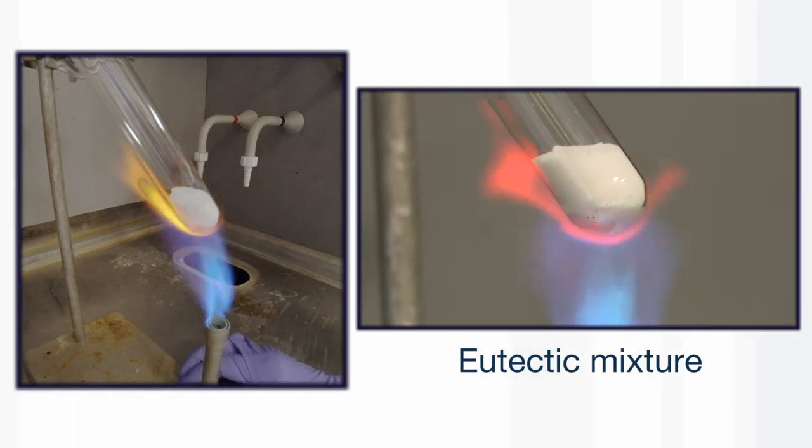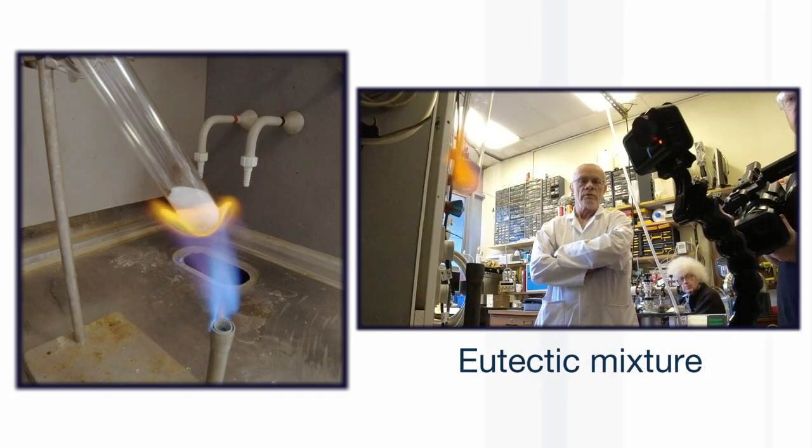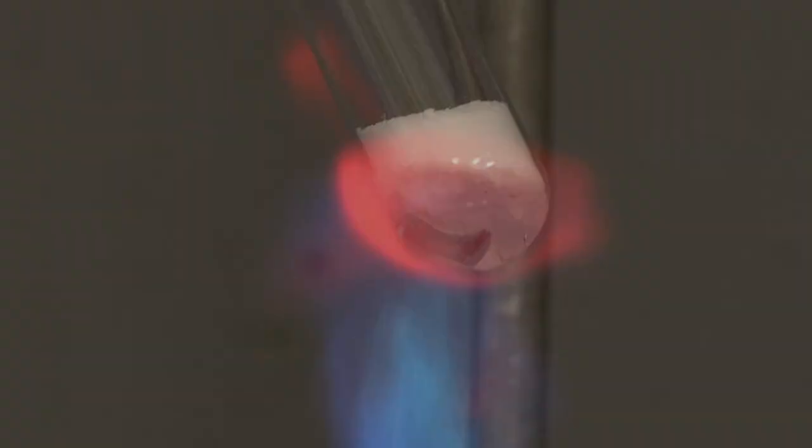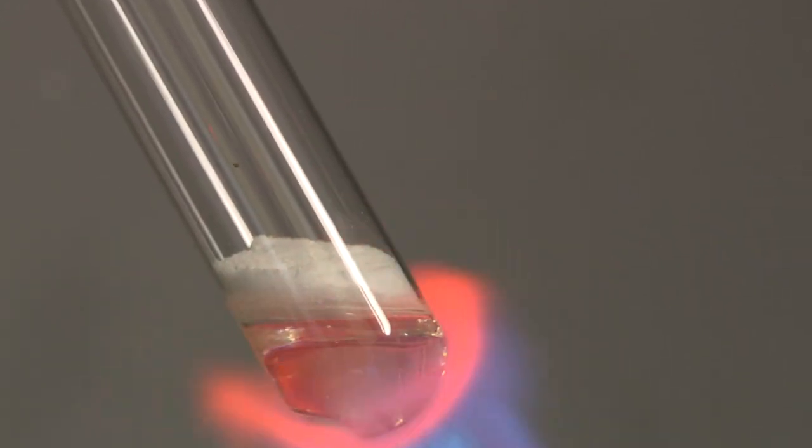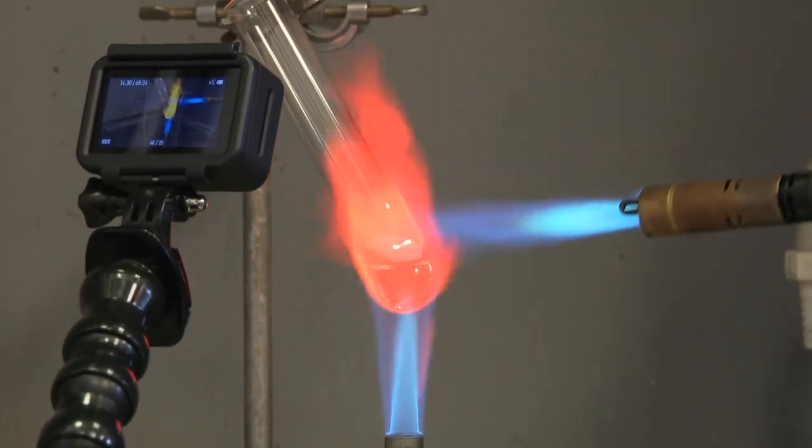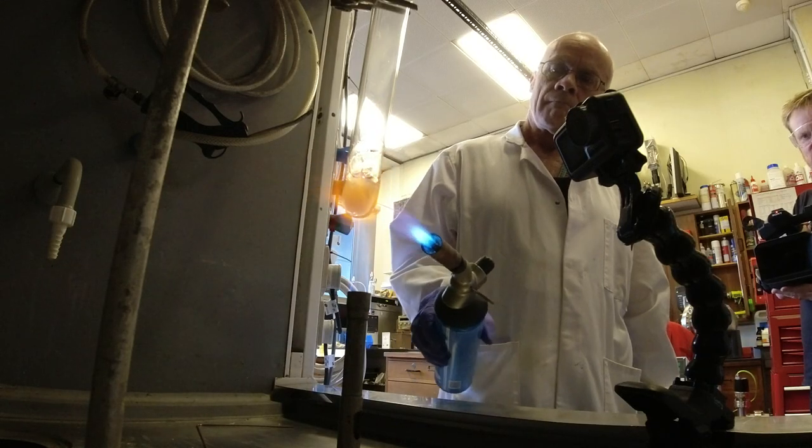So Neil mixed them together and started heating. As he started heating, the bottom part of the mixture began to melt, but the top part was still rather solid. So he used an extra gas gun and it got really hot and everything melted.